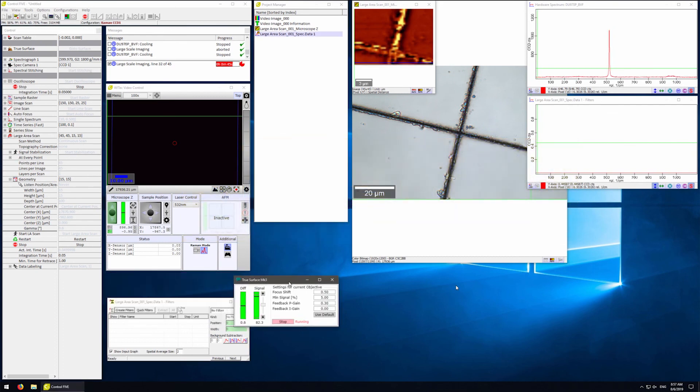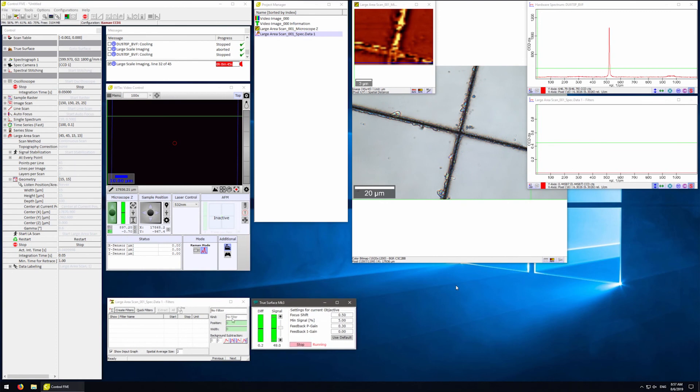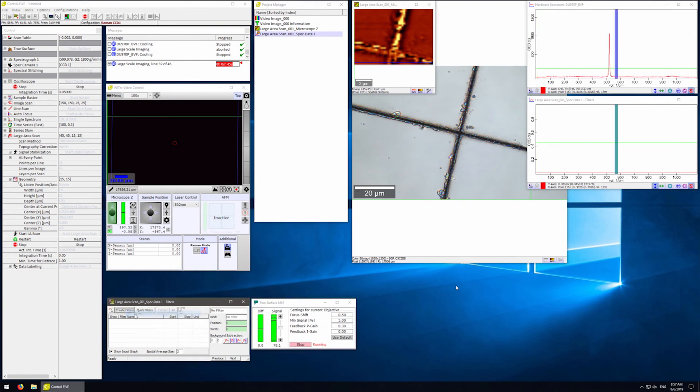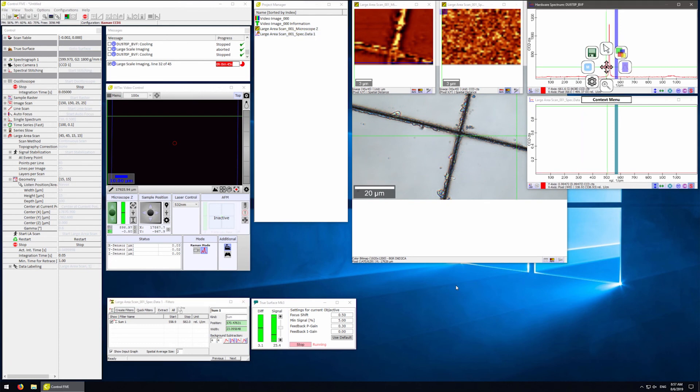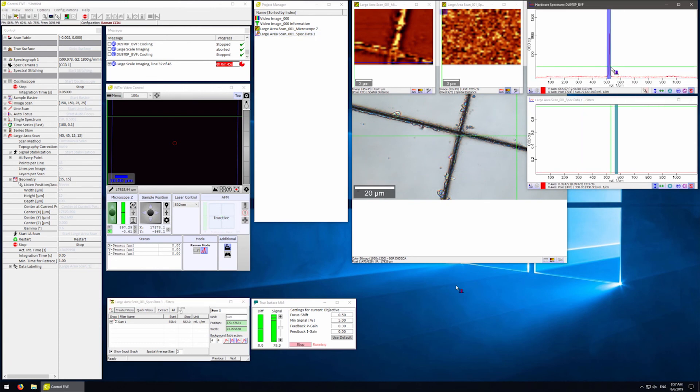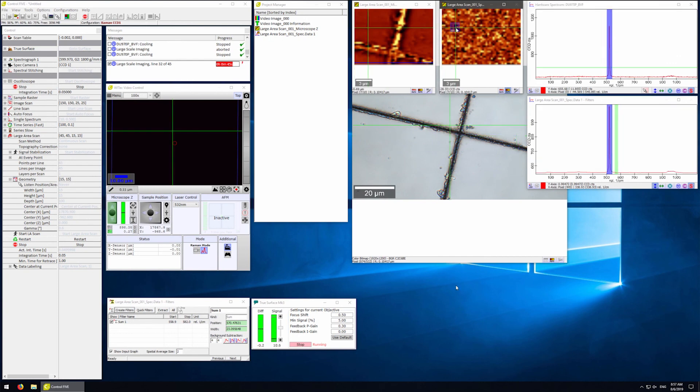While collecting the image, we can look at the data. For example, let's use a Sum Quick Filter. On the spectrum, select the peak of interest. The image produced is now only using the sum of intensity within the highlighted area.